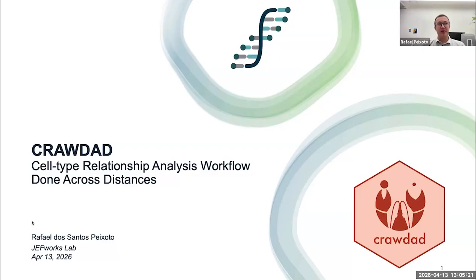In my presentation, I'll talk about CRAWDAD, which stands for Cell Type Relationship Analysis Workflow Done Across Distance. But I think in this field, we try to come up with funny names for our packages, and this is the one we came up with.